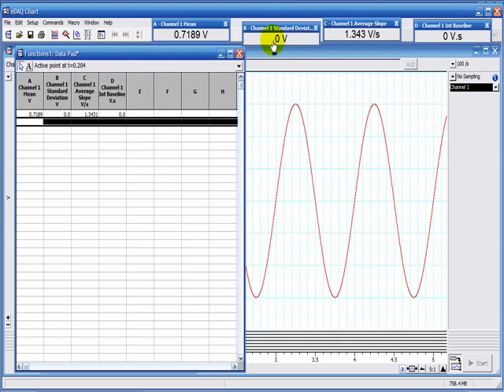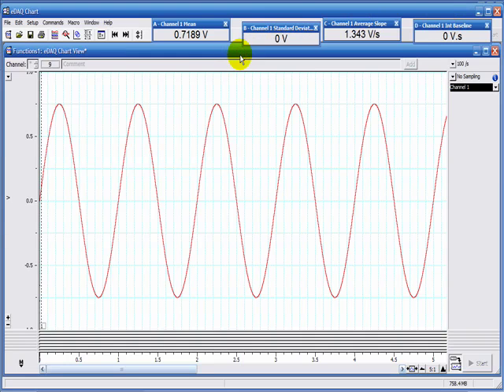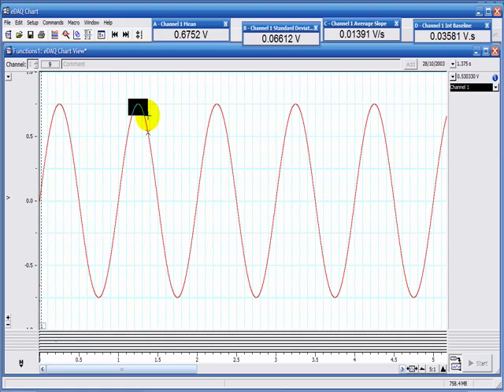And I can now close the data pad. Now when I make a selection like this area here, it calculates the mean in here and the standard deviation in here.